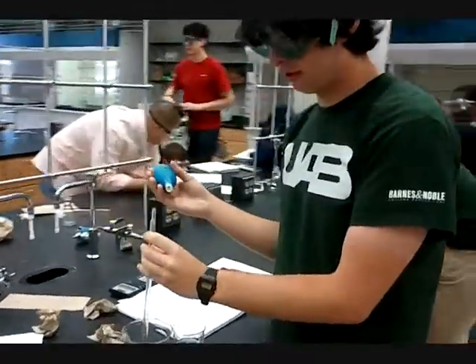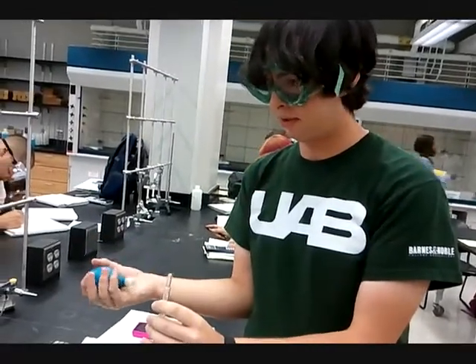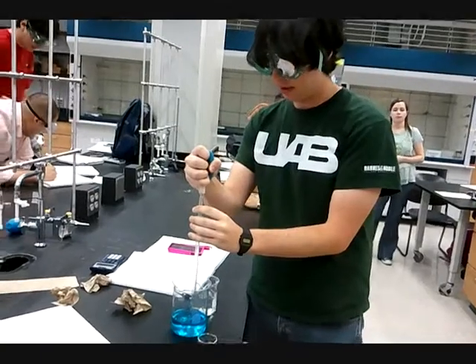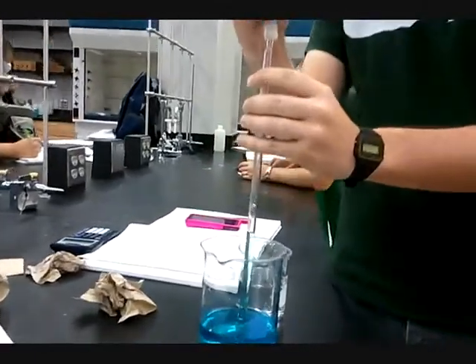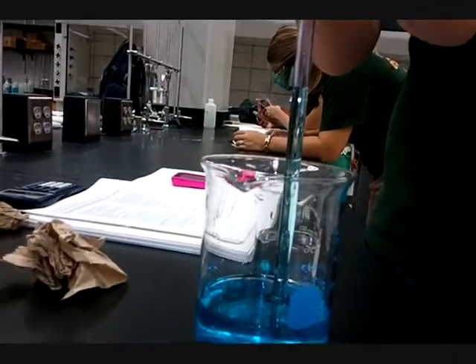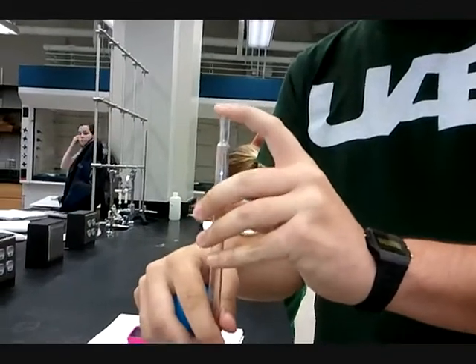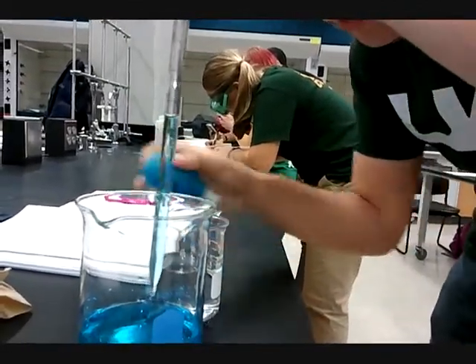Take the pipette, stick it in the solution, and don't let it touch the bottom, and don't let it touch the top. So we're going to squeeze the bulb. Put your finger over the top so it doesn't run out. Then you get an accurate measurement of the meniscus.